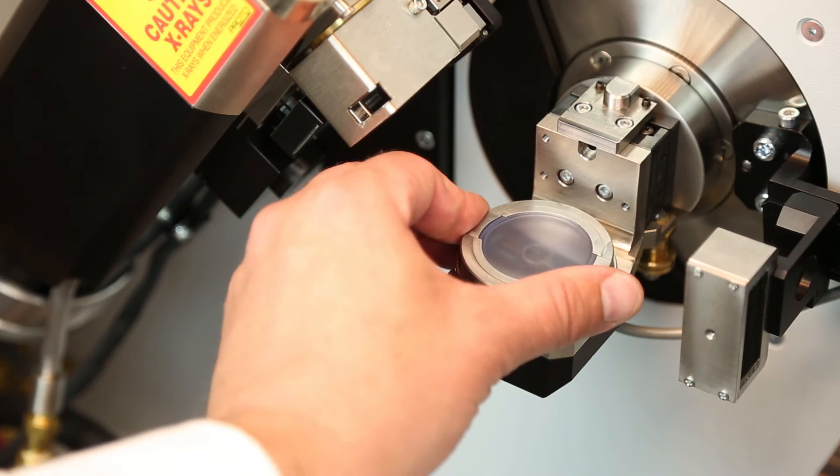One of the greatest features of the AX3D is how versatile it is for a wide variety of applications. When we developed the system we wanted the user to be able to focus on their research and not spend hours figuring out how to use the system. An inclined theta two theta geometry prevents any spilling of samples while allowing easy access for swapping x-ray tubes.